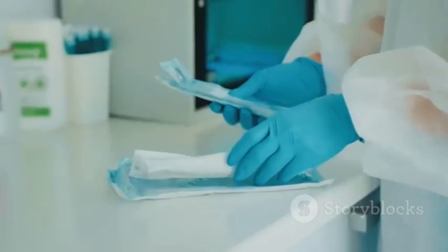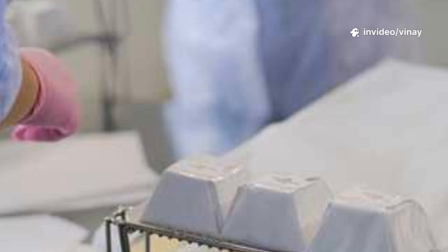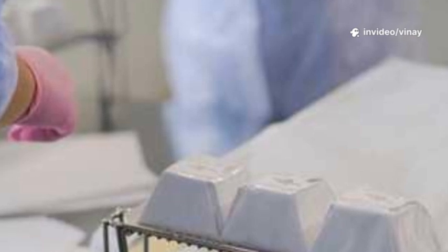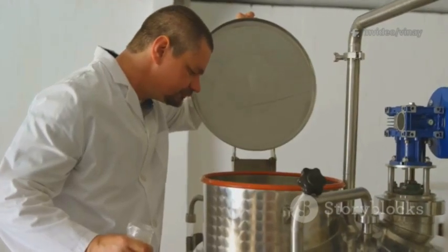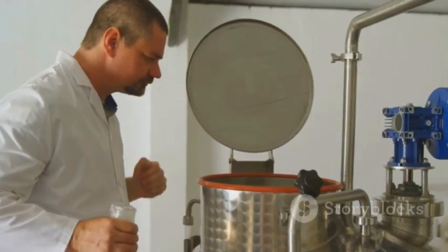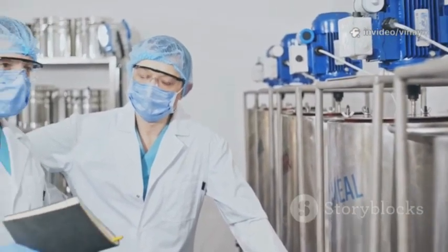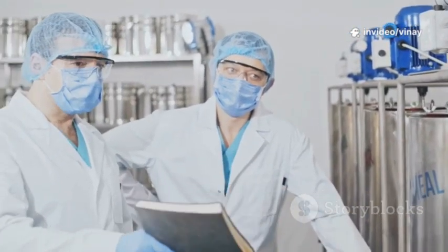The filter has a pore size, typically 0.22 microns or smaller, that is small enough to physically remove bacteria from the solution. The integrity of this filter must be confirmed both before and after use through a validated test, such as a bubble point or pressure hold test, to ensure it was not compromised during the process.